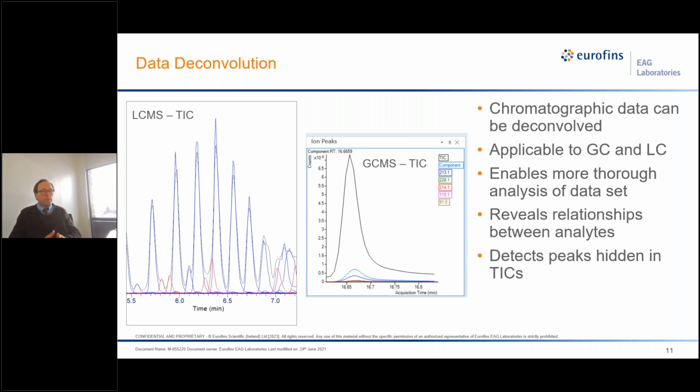So we could be searching for some sort of structural assignment to something that's actually in-source fragmentation. And that would be not good, because then we could have a false positive where we may be assessing the safety of a device on a compound that's not even there. So one thing to know about this is that there's no free lunch.